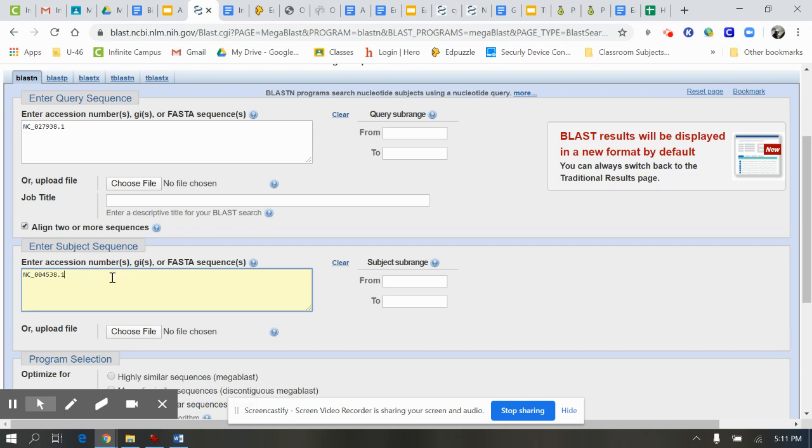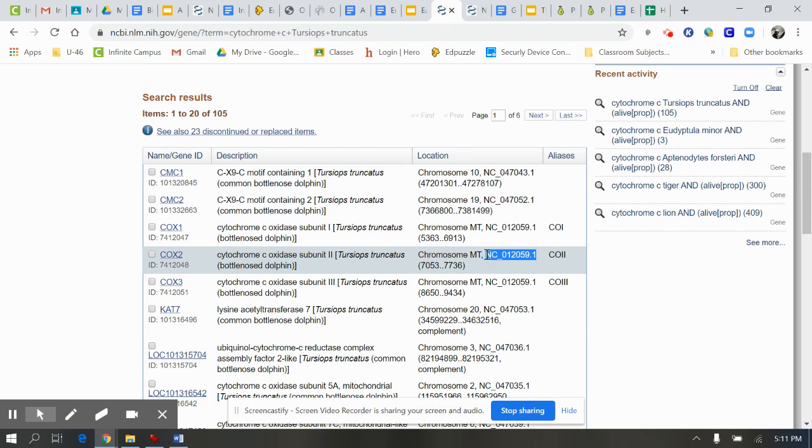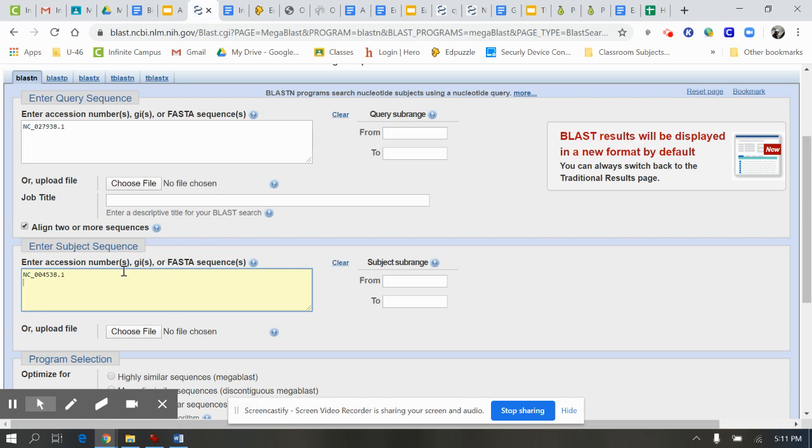BLAST site. And again, I should put Nile crocodile in here, but I don't need to show you the same thing 3 times. Twice will be good enough, because the fun part is when you see how cool this is when it spits out numbers. It says how closely related something is. So Control V, my error. I don't want to Control V just yet. I thought I copied the catalog number, but apparently not. So let me go back here and try Control C again. Now I'll try to go back here and hopefully it'll punch the number in correctly.